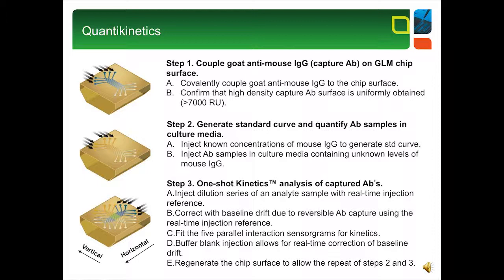As we know, when we analyze antibodies using SPR biosensors, it is very typical to use capture surface chemistry, which means covalently linking a capture reagent such as protein A, protein G, or anti-Fc antibody to the sensor chip surface and use this capture reagent to capture the antibody samples. And then in the next step, we inject antigens to measure the kinetics between the antibody and the antigen.